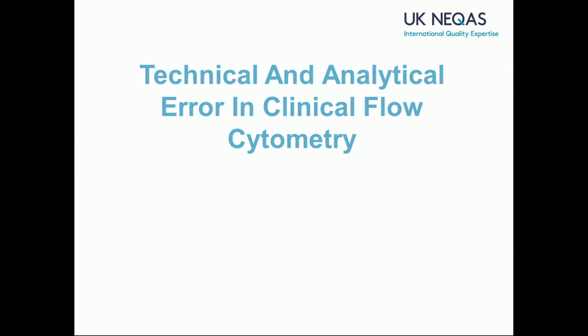A couple of the things we're not reporting on, though, because we've only just gone live with them. We've now got a pilot program for CSF. I don't know if anybody's enrolled in it, but if you're testing CSF, you might be interested in that one. The first samples are actually going out this week, because we like keeping busy, so we'll have some data on that soon.